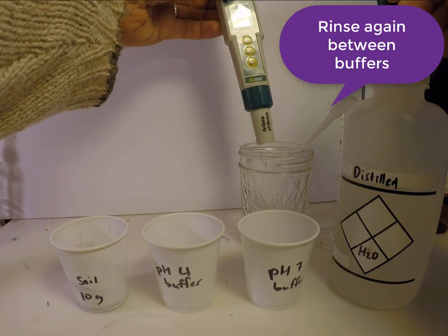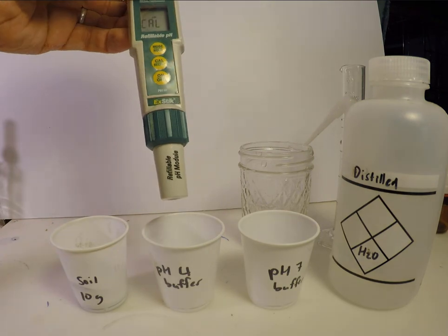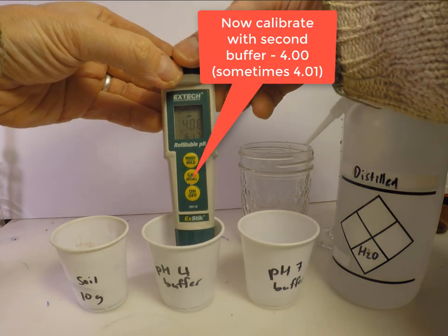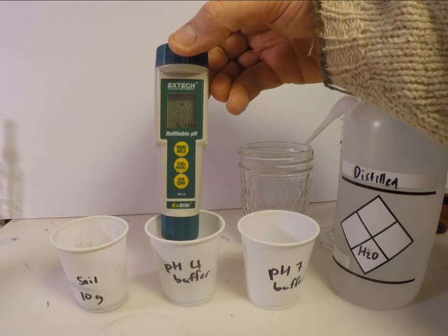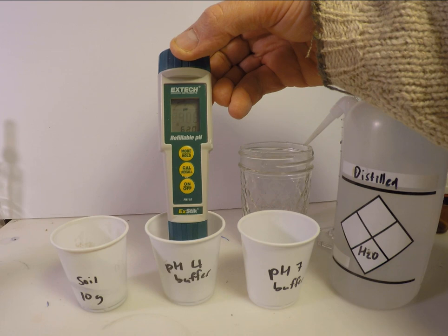After rinsing, if we then press the cal button again, the meter will wait for another buffer and will automatically detect the pH4 buffer. When this stabilizes, the meter is calibrated at two pH points, pH4 and pH7.